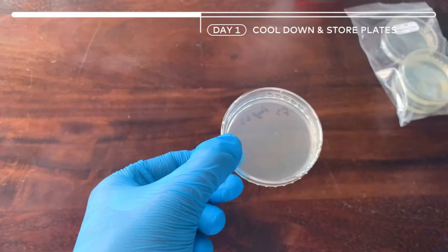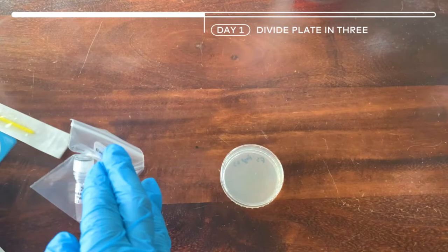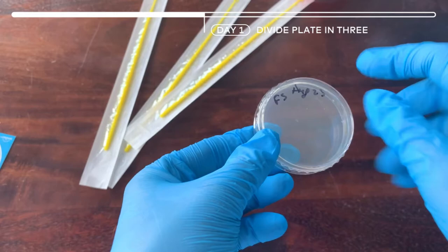Now let's get started with our petri dish. First let's get our bacteria paint. We have three bacteria paints, which means we will need to use three yellow loops. We have them too. So first we are going to divide the bottom of the petri dish into three sections.